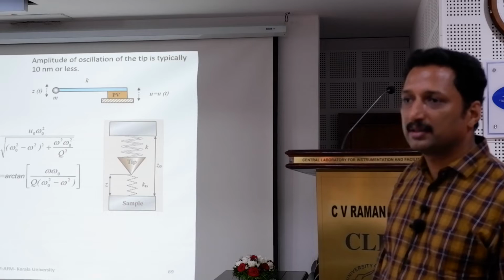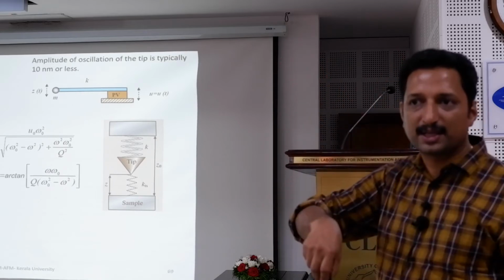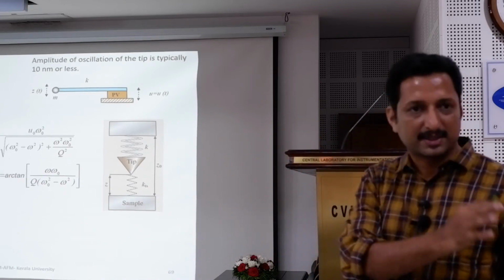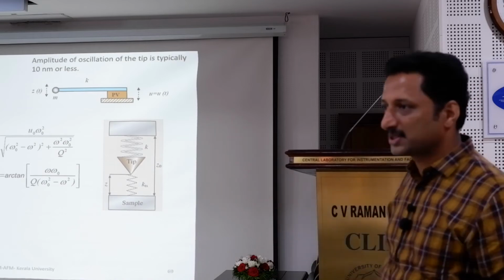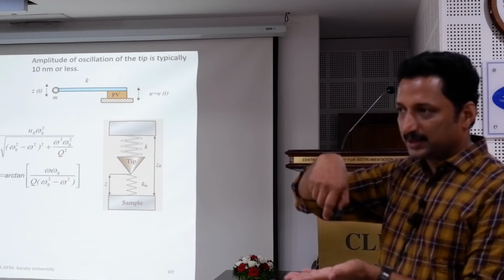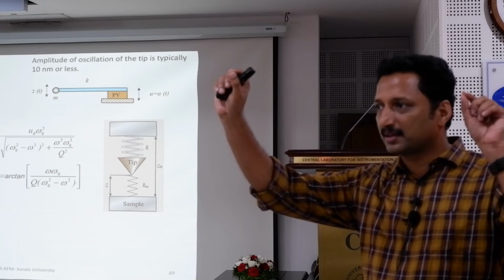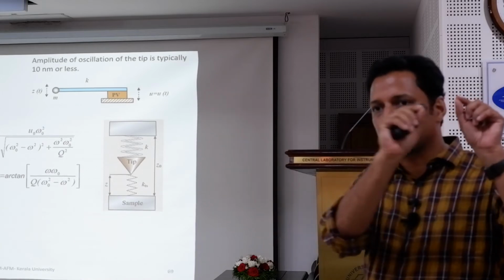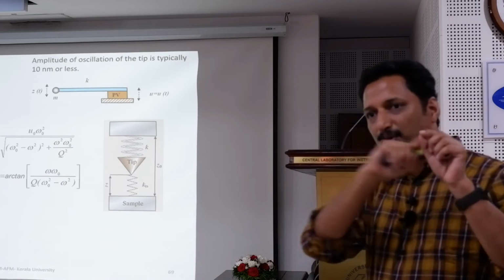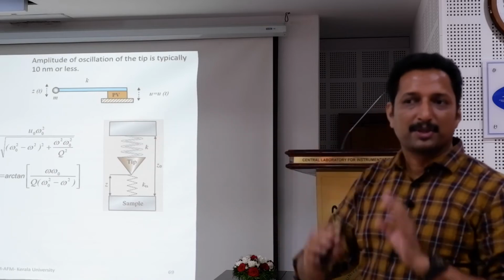So very easily, from the same signal of the vibration or deflection of the cantilever, we can separate out the frequency component, the phase component, and the height component. So we get 3 images at the same time, actually 6 images. Because the scanning goes from left to right, takes one step down, comes back to the left, one step down, comes back to the right, like that. Most software splits all the left to right scans into one image, and all the right to left into another image.